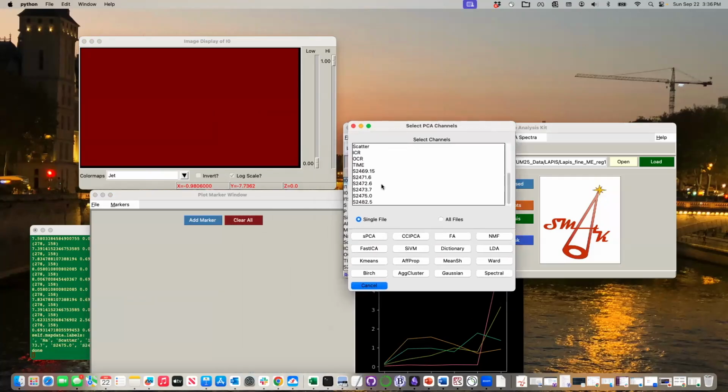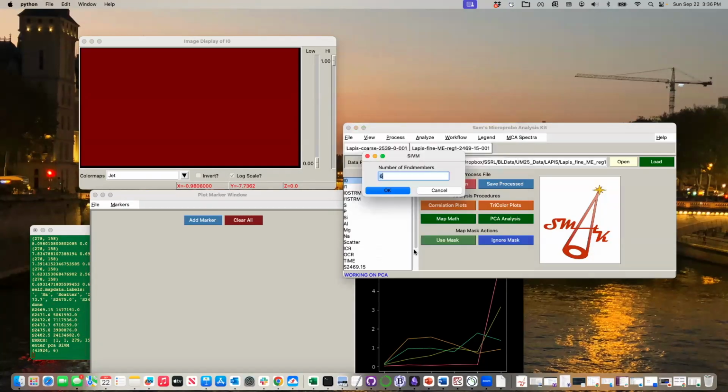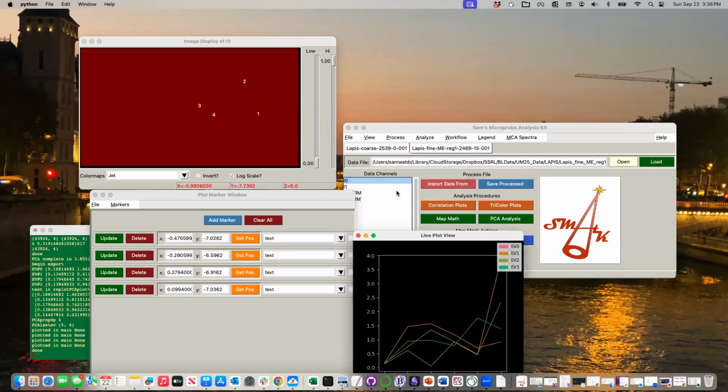Here we go. Highlight all of these. Sieve them again. We'll still do 4. But now we'll try to make this half the mean rather than a quarter of the mean. Hopefully we can, actually, no, keep this at a 1 on the mean. Let's be hardcore. Oh yeah, and now all 4 of those are closer to the center. I like that a little bit better.